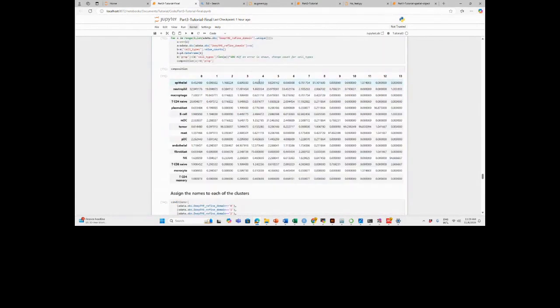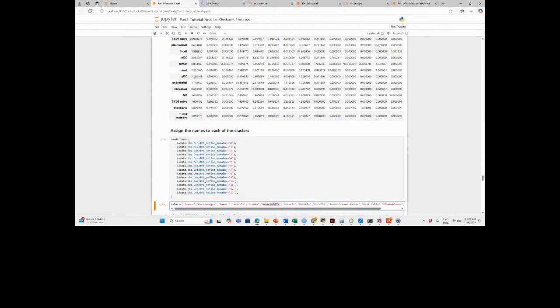That's good. Then for number 5, I can see that I have neutrophils, macrophages, and myeloid dendritic cells. So all of these 3 types of cells are considered myeloid cells. So I'm just going to change it and put it in here. Myeloid cells.